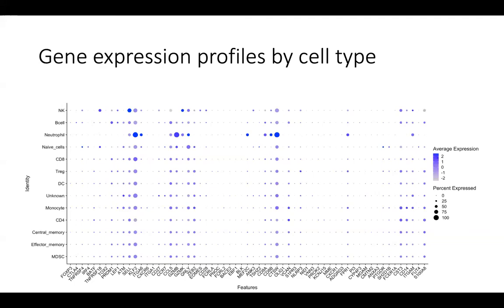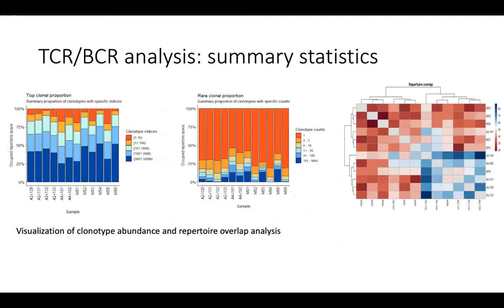And that is also rapidly growing in the time that I've been doing this. We recently finished analyzing a data set for a client out of Ohio State, where they were looking at patient responses to a certain drug, both in terms of gene expression profiles and the TCR repertoire and the changes in the TCR repertoire space.